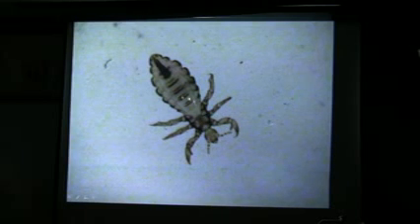Here is another one. This is, I don't know. One of them is bigger than the other one, and I keep forgetting which one is which. But don't worry, you don't have to tell them apart, humanus from capitis. Only size indicates which one is bigger, which one is smaller.